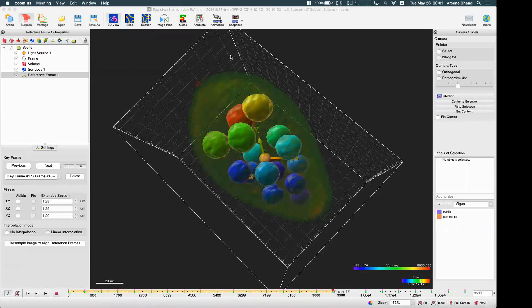Good to hear that. We try to develop more new applications in new versions. The rotational one is really great too — I couldn't imagine trying to track that with your eye over time. For example, if you have a zebrafish which isn't really fixed and has some drift, you can use the surface of the zebrafish as a reference frame, then track the blood flow or movement inside the zebrafish while fixing the view of the zebrafish — without the effect of drift or rotation.